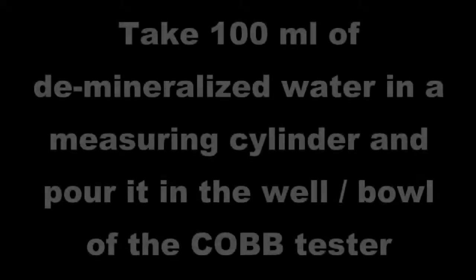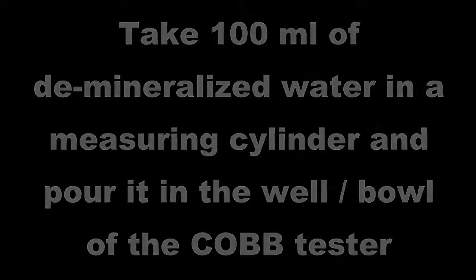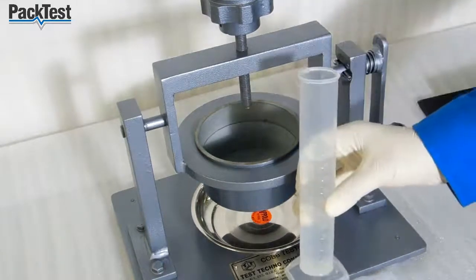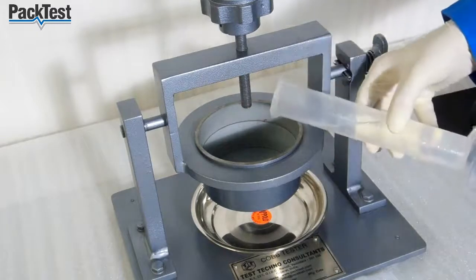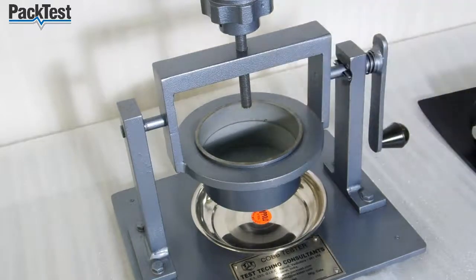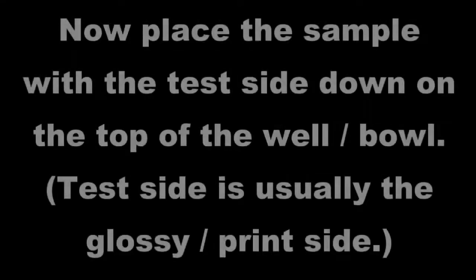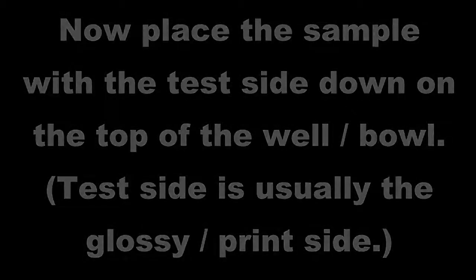Take 100 ml of demineralized water in a measuring cylinder and pour it in the well or bowl of the Cobb tester. Now place the sample with the test side down on the top of the well or bowl. Test side is usually the glossy or print side.